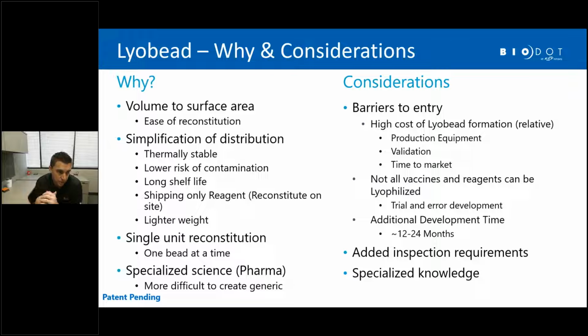cake lyophilization can present. The other real improvement is the ability to now manipulate these beads or these doses of reagents in a very meaningful way. There's now the ability, if you're doing kit manufacturing, or if you're trying to precisely dose the amount of active reagent into a vial, now you can pick and place these beads potentially with automation at high speed and really achieve some pretty unique things with regard to applications.